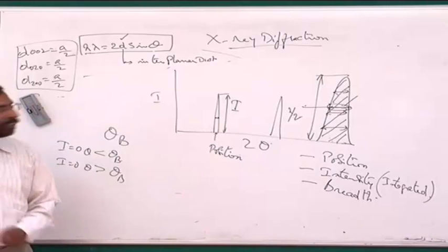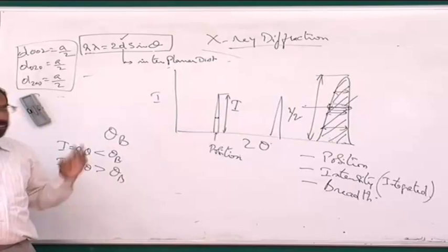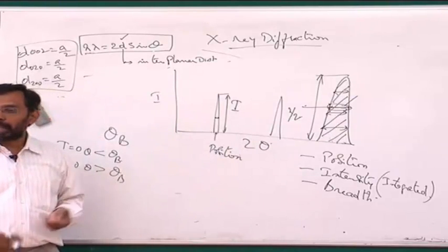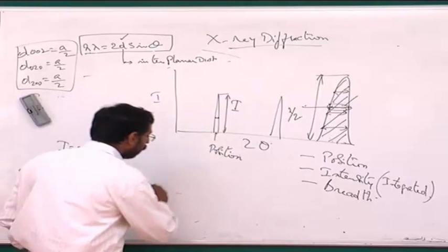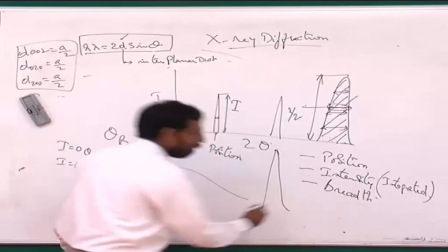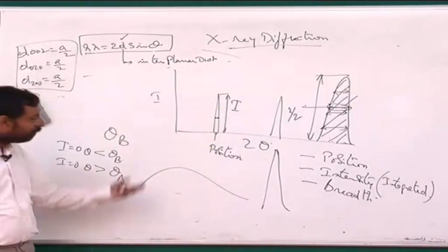When we deal with how peak broadening matters, at that time I will tell you why integrated intensity is important. Sometimes you may see that the peak may be broad. Sometimes you may see a peak that is very sharp. The same material, you would see this happening.